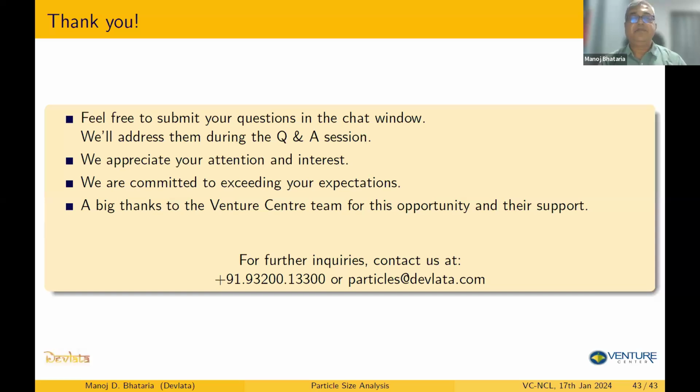Second, the magnification that you have for a microscope is not exact. So even if it is written 10x, 50x or 100x, that x is not perfect. That 10 may be 10.01 or something like that. So you need to have a good calibration standard when you're using a microscope.